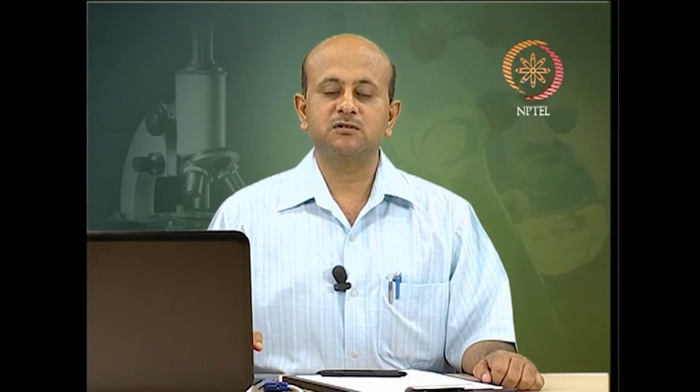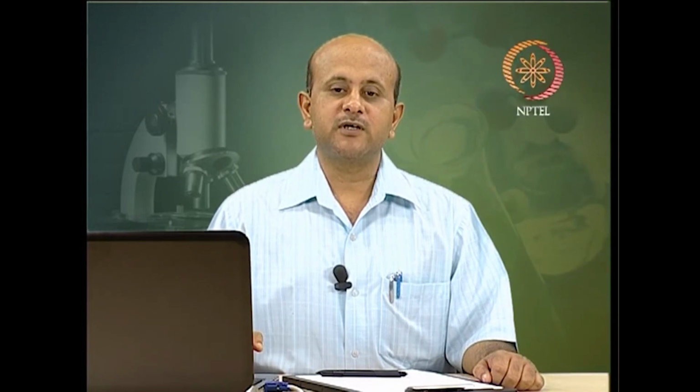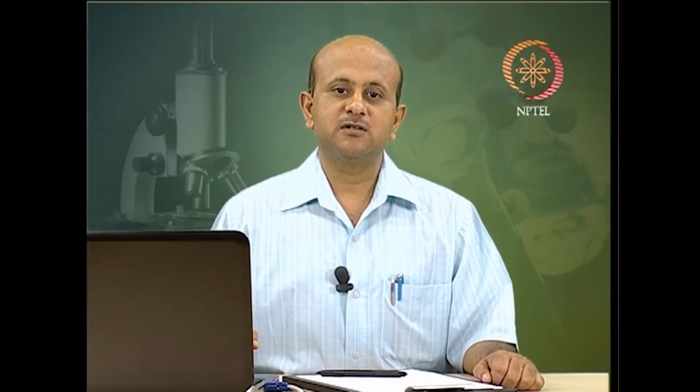The rotor is solid in analytical ultracentrifugation, with holes to hold the cells that contain samples, and it is suspended on a wire coming from the drive shaft of a high speed motor. The tip of the rotor contains a thermistor for measuring temperature. I will show you this in a little while. The simplest rotor has two cells. One is called the analytical cell and the other is called the counterpoise cell.